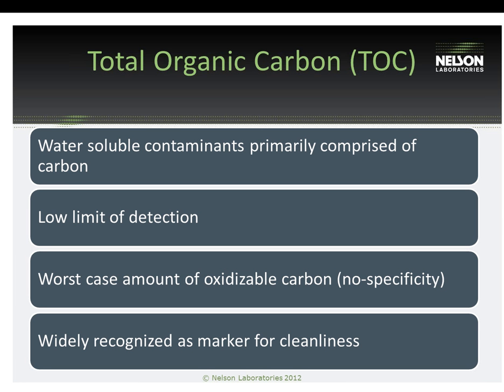However, also with TOC, it reports out a worst case value of the total amount of carbon that's present in the extract. So there's no specificity here, unlike with the gravimetric test, where we have the option of FTIR to try and ID or identify what's in that residue. With TOC, we give a worst-case quantitative amount of carbon, which also can be very beneficial. There's just no specificity here.